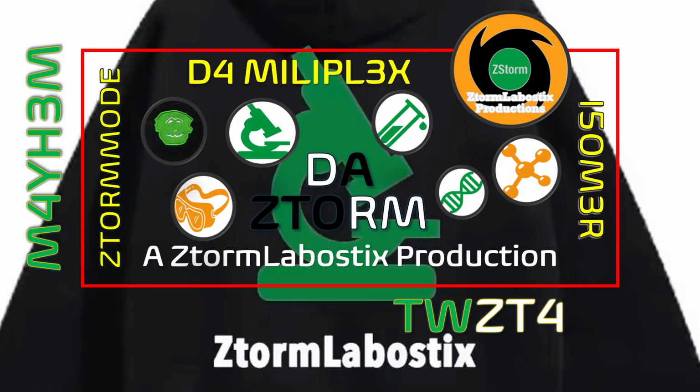Once collected, a library can be prepared to allow the nanopore sequencing technology to work.